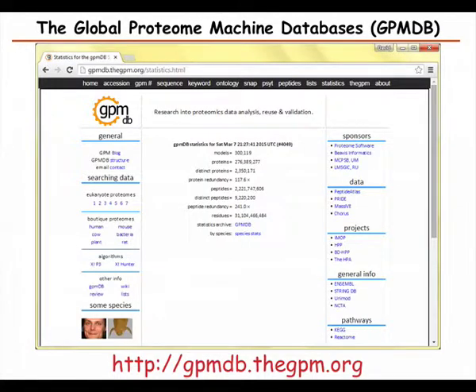And then the one that I've been involved in is the Global Proteome Machine, and the main person behind this is Ron Beavis at the University of Manitoba. He came up with this idea that one should really have a genomic focus, so he built it on Ensembl. And for every gene or protein, you can dig down and see what evidence there is in the public domain.